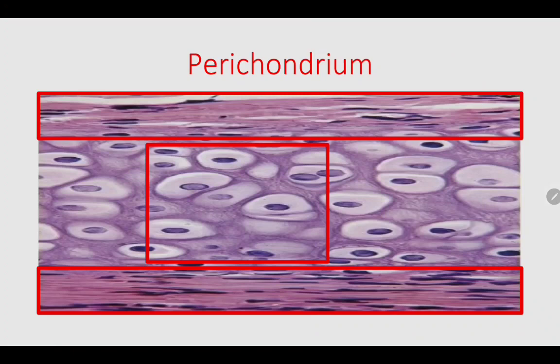So in this picture, guys, if I'm going to ask you, what is this? This is the perichondrium. Okay, if you're going to be asked, ano bang content ng perichondrium? Meron siyang fibroblast, merong mga blood vessels, merong mga nerves, 'di ba? Anong klaseng connective tissue ang present? Dense irregular connective tissue.